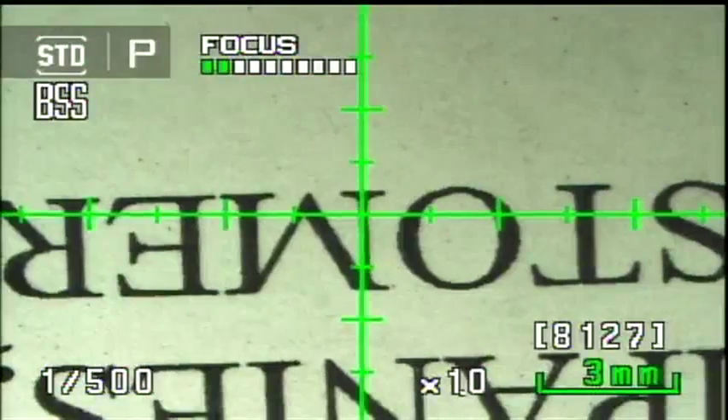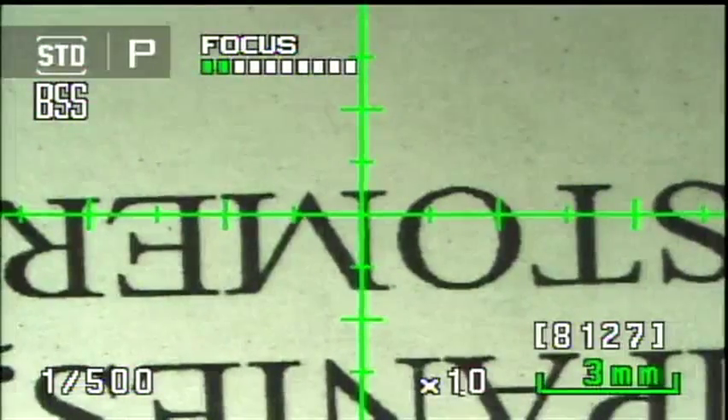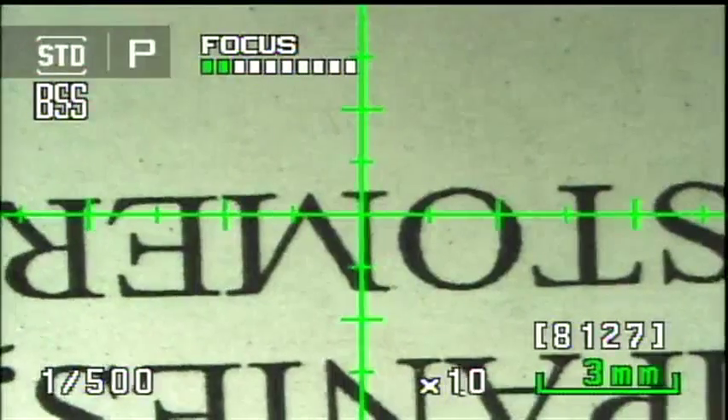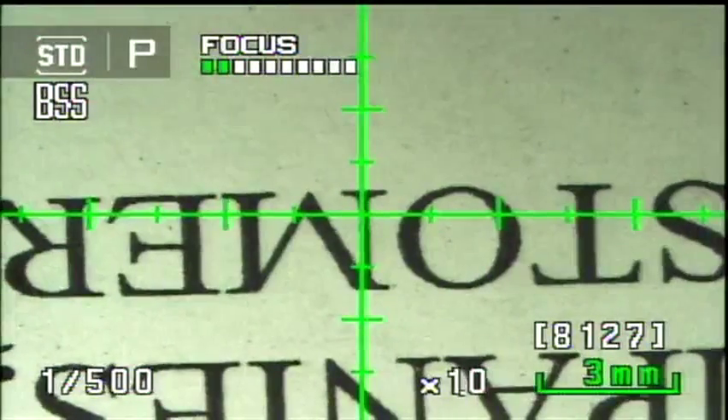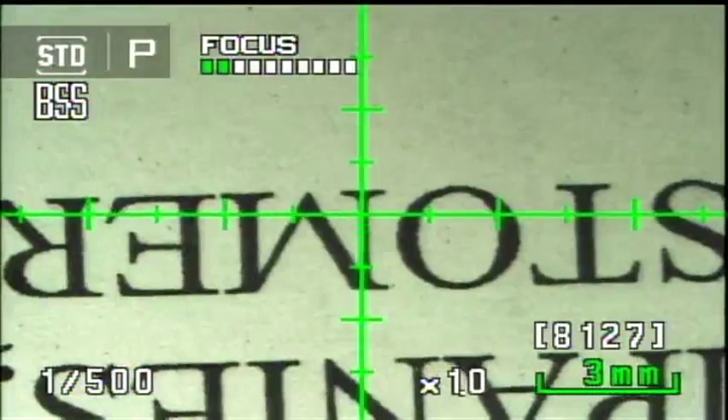I can take measurements and also take a still picture. When I snap that picture, I have the option of storing the scale superimposed on the saved image or not — which is useful for documentation and inspection purposes.